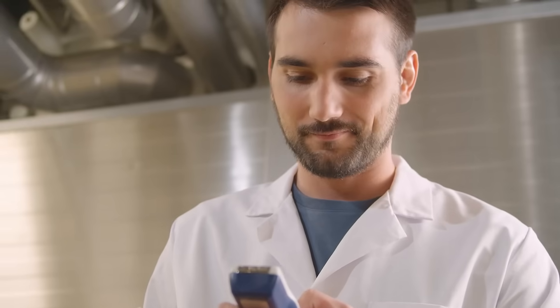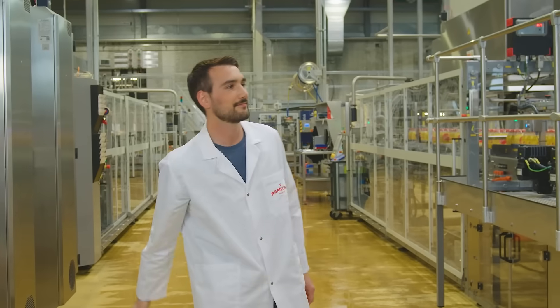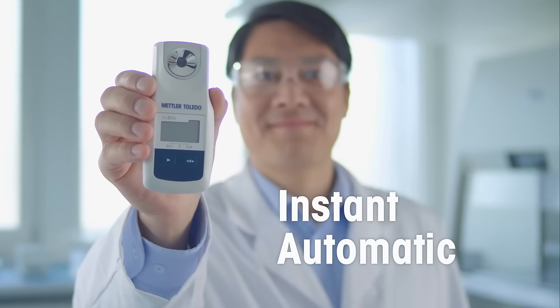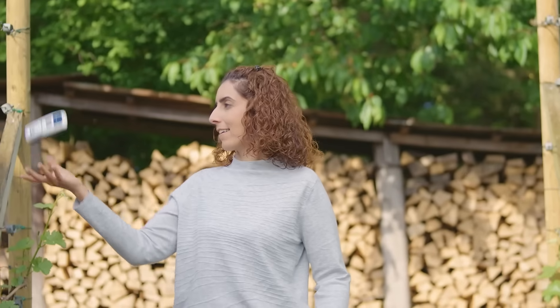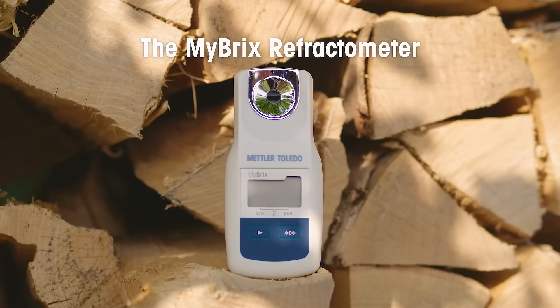Mettler Toledo's MyBrix features all that. The MyBrix Refractometer.